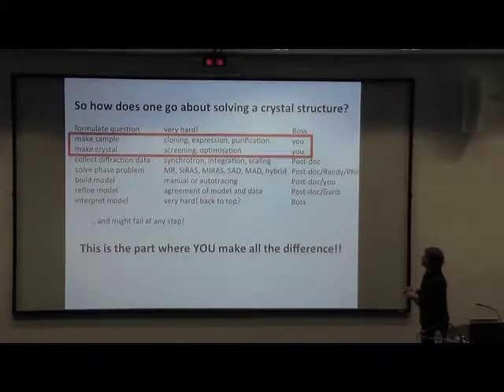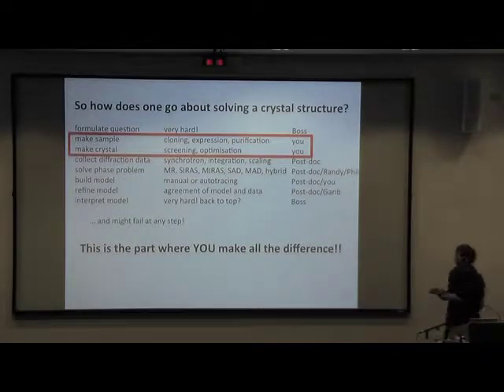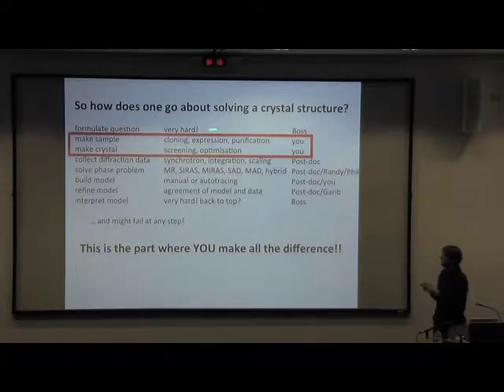And actually, I find it the most interesting and most exciting part of the whole project, because this is where you can really tinker with the protein, find out how it works, and find maybe that essential clue that will give you the crystal. The rest, not to trivialize it, but it's kind of straightforward. All the methods are in place. If you got your crystals, this can happen in a matter of days. But getting the crystals can take you several years.